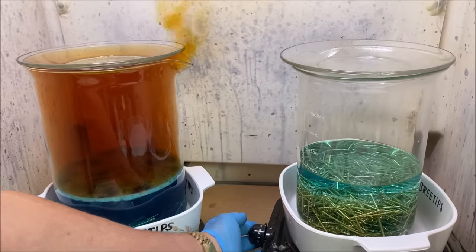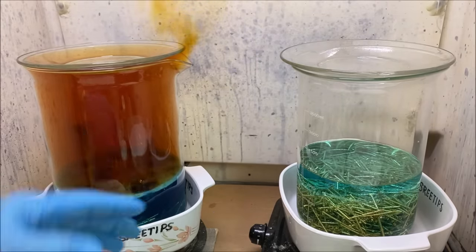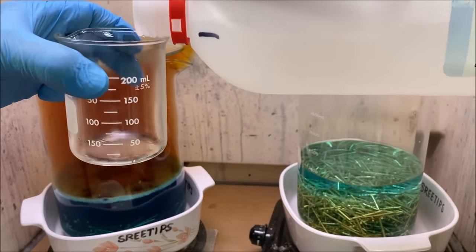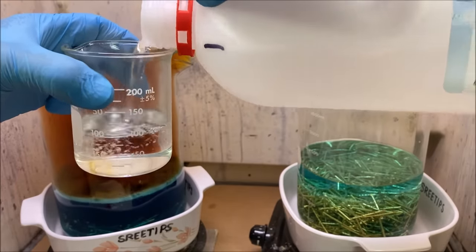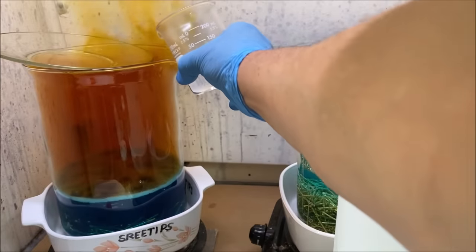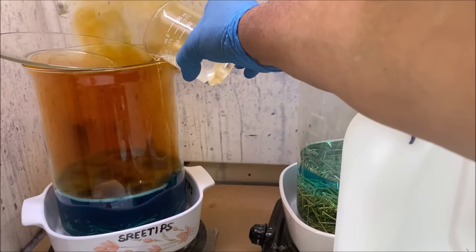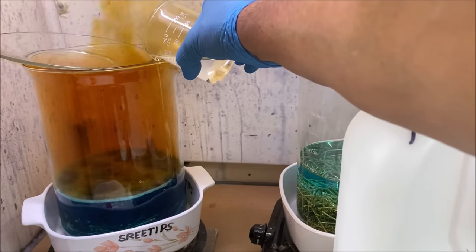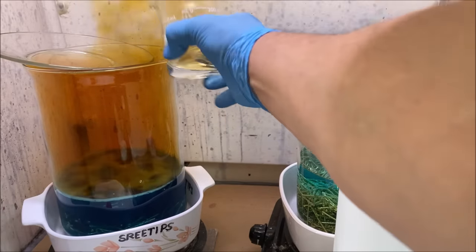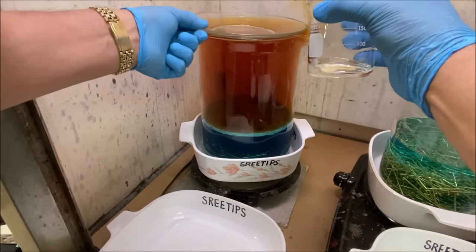I'm going to turn the heat on for this beaker right here, and what we'll do is add another shot of nitric acid to the one on the left over here. That's 100 milliliters. I don't know if I can get it all in there at once or not. Add it real slow. Sometimes nitric acid will take off on you, a delayed reaction if you put too much in there. All right, that's about half of what I measured out. I'm going to add the rest of the nitric in here now.